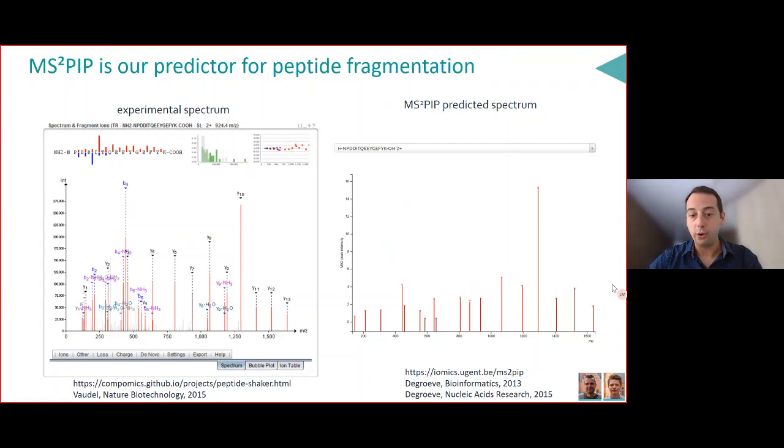And of course, as you know, other people have now started doing this as well, right? So in 2018 and 19, new algorithms came out that used even more sophisticated methods of predicting certain aspects that tend to do slightly better than MS2PIP. But interestingly, if you read the papers and you look at the applications, you will see that there is a law of diminishing returns at work where all of these algorithms now appear to be sufficiently good that it doesn't really matter downstream which particular one you use. So that's really good because now you actually have a nice choice of spectral prediction algorithms.